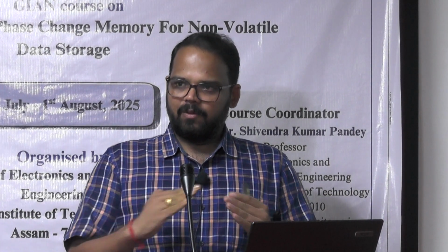Okay, if not, then we should move towards the laboratory. You just go there and see the instrument, and possibly we'll try to show you the deposition also, deposition of any material, where you can see the plasma and the sputtering setup, what components are available, and how we can prepare a chalcogenide based thin film. Okay, thank you. Let's move towards the lab.